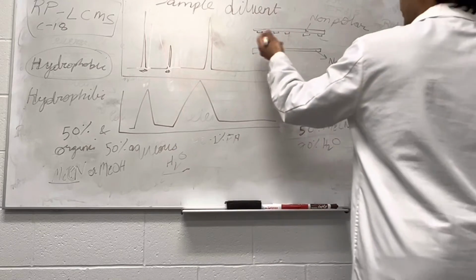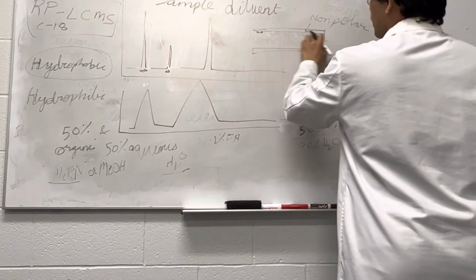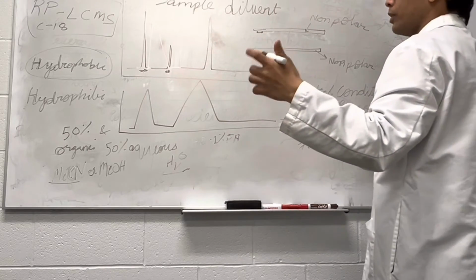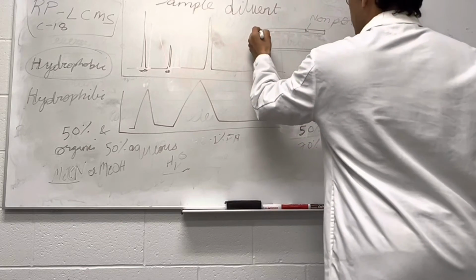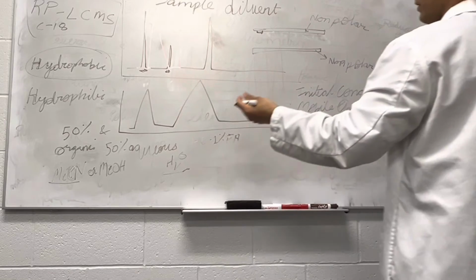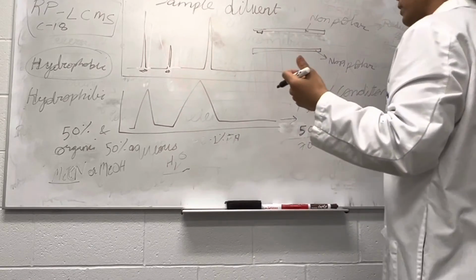So they will not segregate into different sites; instead they will get stuck at a specific position based on the analyte strength and the column strength.